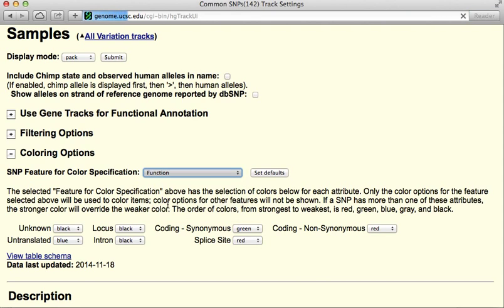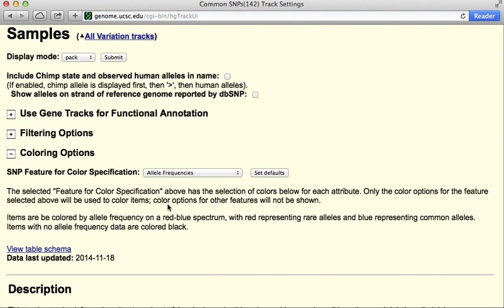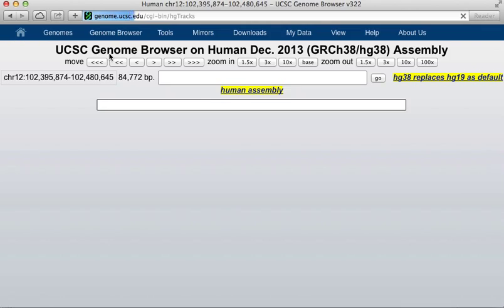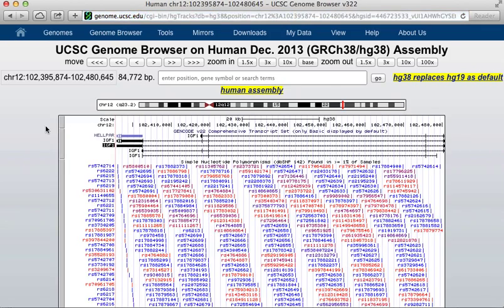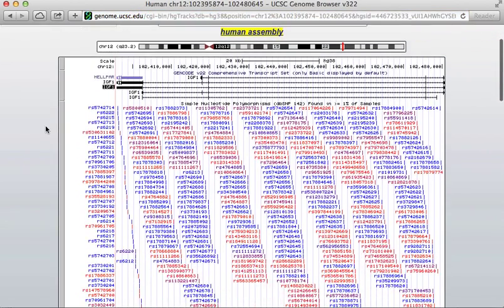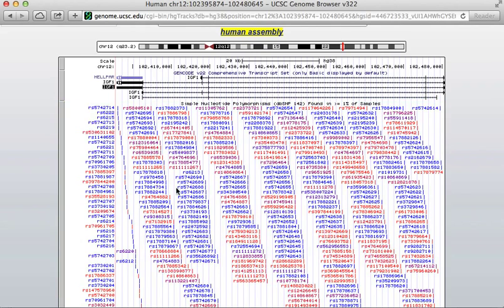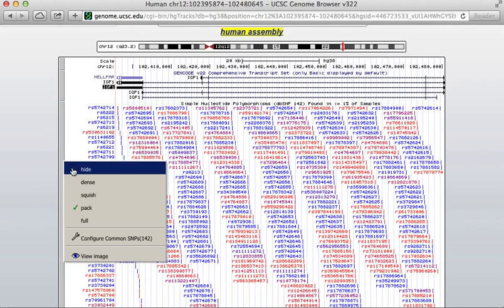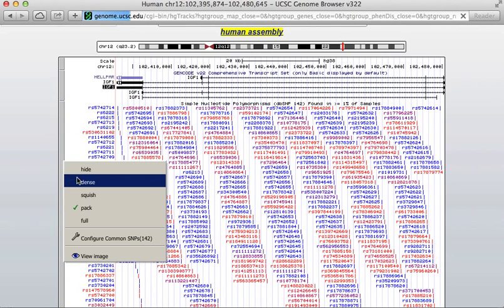I can change the coloring, or I can change what kinds of information is colored. For example, I can color instead by allele frequencies — so now red will be rare alleles and blue will be more common alleles. And if I hit submit and go back to that, you can see the coloring has changed. I'm going to condense that back down to the dense view.